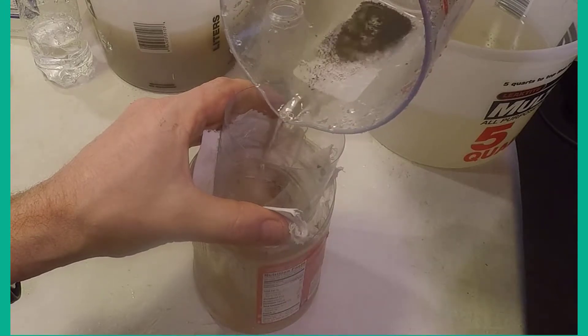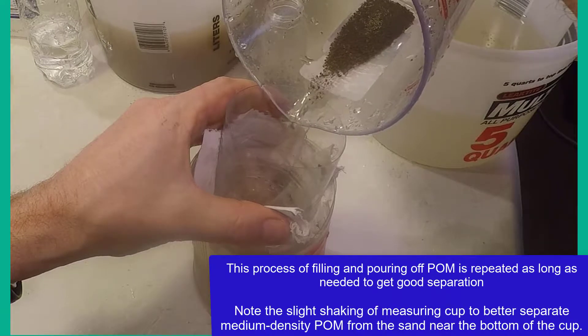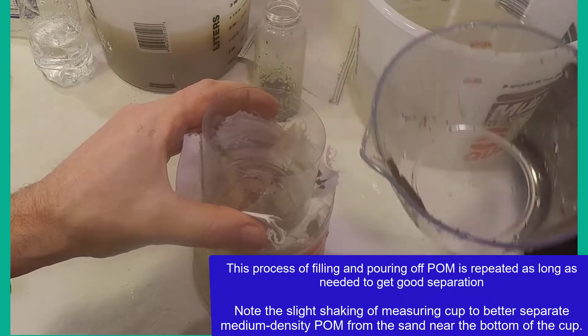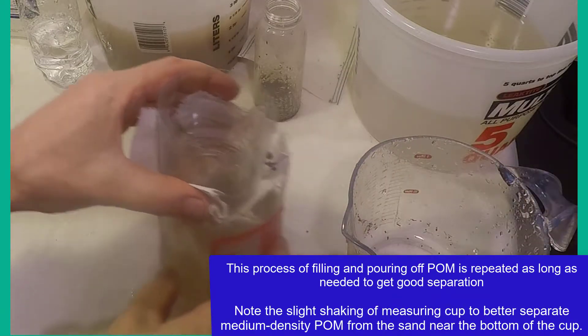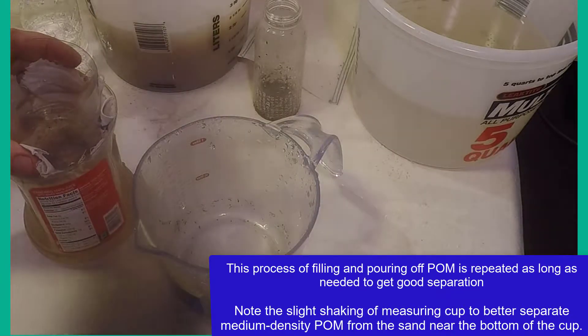Then work to separate the medium density organic matter that is floating just above the mineral material at the bottom of the decanting container. The mineral material will look like sand or small stones.